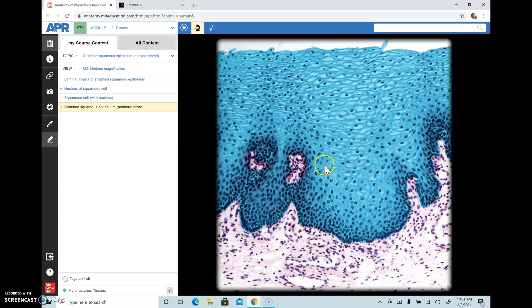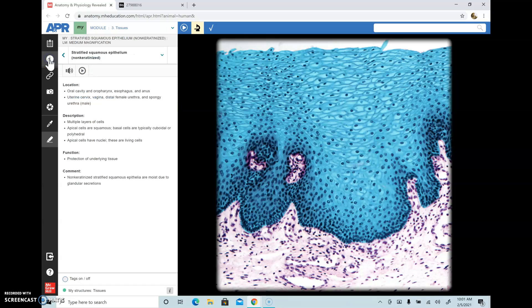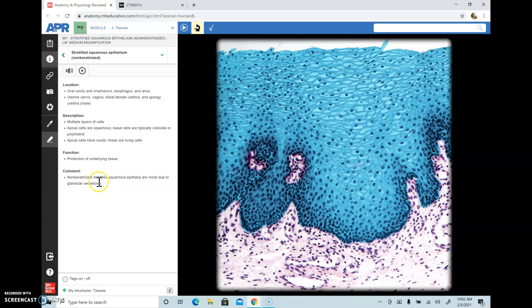This whole layer is considered stratified squamous epithelium. You find this epithelium in the oral cavity, oropharynx, esophagus, anus, uterine cervix, vagina, and urethra in both male and female. All of these parts of the body undergo a lot of friction and abrasion, so they need to be well protected, but at the same time they are moist — and that's why these cells are non-keratinized.